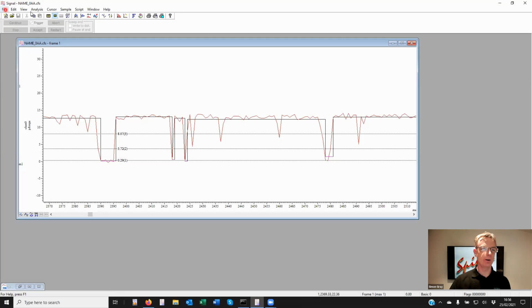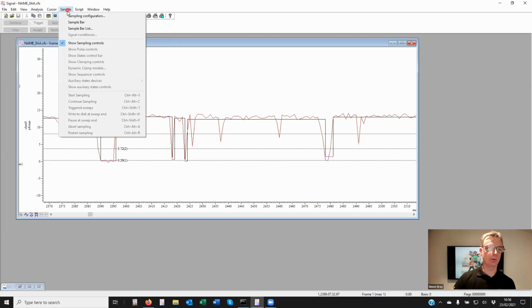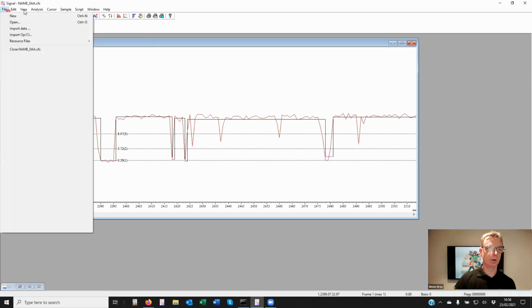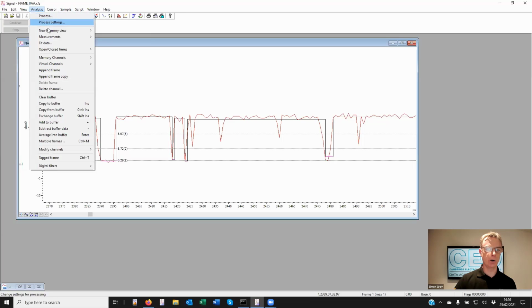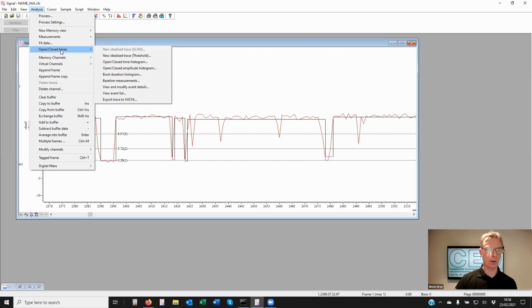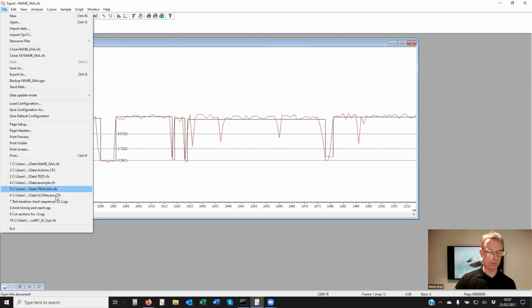We do have other methods of forming the idealized trace. The scan analysis, in particular, is very powerful. It was developed by David Colquhoun, and copes very well with subconductance levels and filtered data. In order to make that work, I would have to just open a different file.